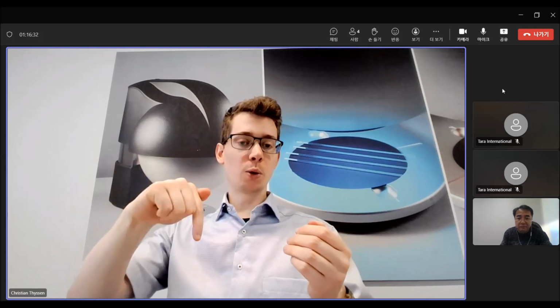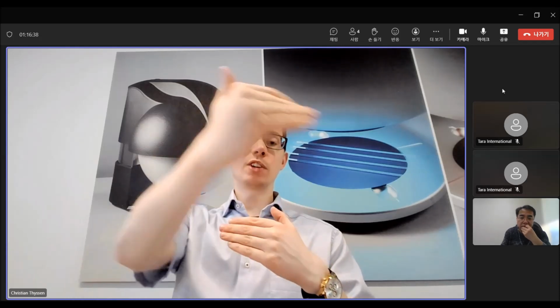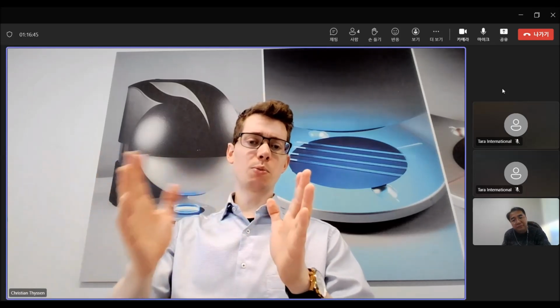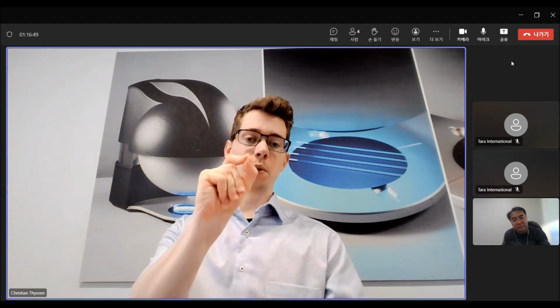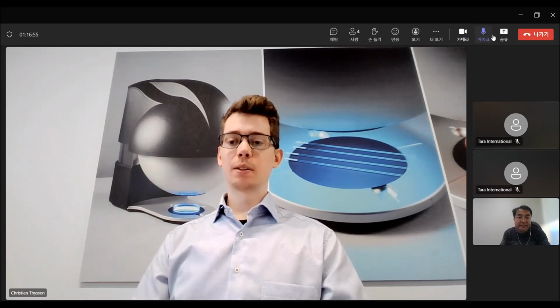If you train node, you only train the top node. If you train branch, you train the node and then the second node. So when you have deeper models, training branch will train all of the nodes, but train node will only train the one node you are in at the moment. Oh, no problem.